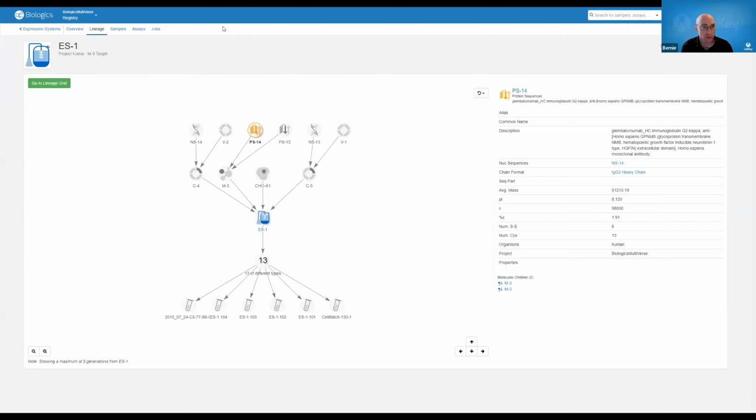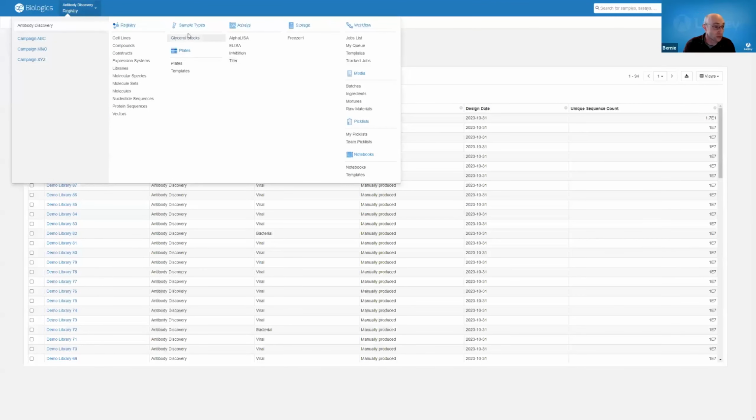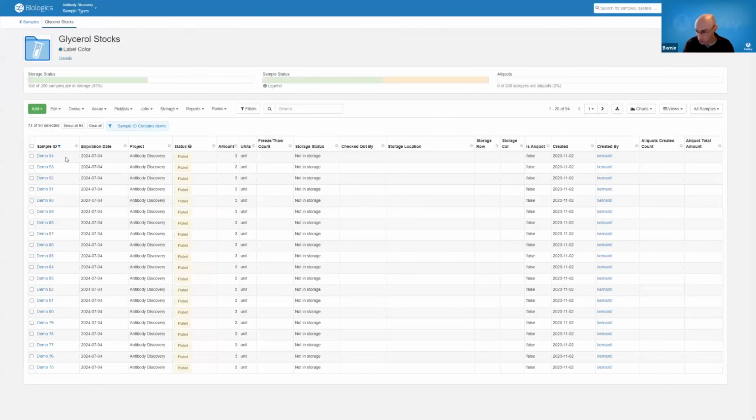Now, here we go. Here, I can capture information about my libraries. In this case, it's just some basic information about their type, their diversity. These libraries each have stocks that may be available for use, and I can go over and show you some of those. So, analogous names to show those relationships by convention here. And in this case, we can see that these particular samples, these particular stocks, are plated by yours truly, and it's easy for me to choose those samples, and I can either plate them or pool them. So depending on how you're operating, in my case, I can pool these down and then plate them, or I can select all of these things and I can create a new plate with their contents.